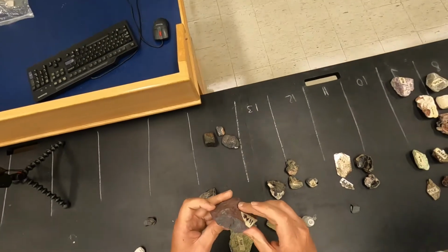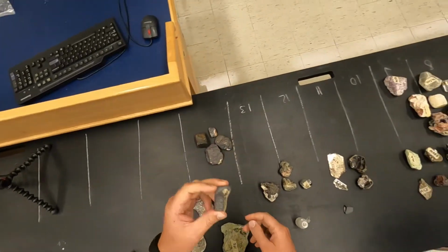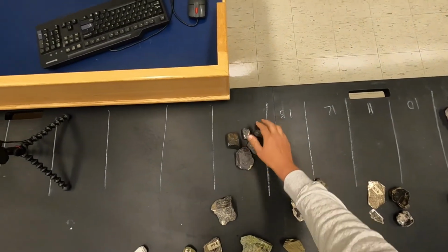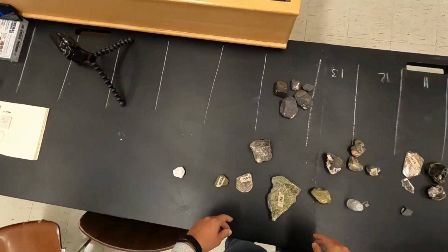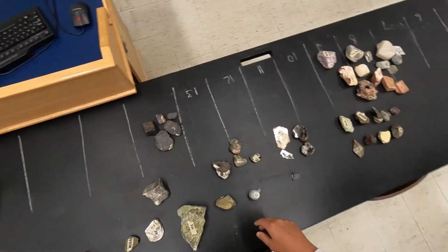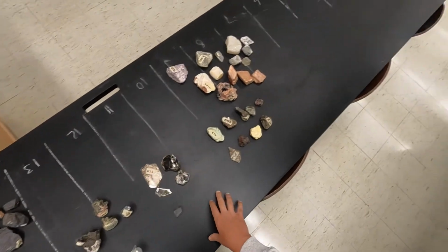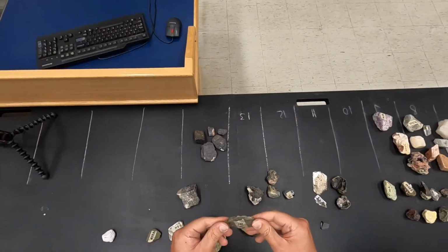So we have here bands of hematite and likely magnetite, and this is magnetite. So magnetite, hematite, galena will go in this group of the opaque minerals. And also this other mineral here, which is your pyrrhotite.